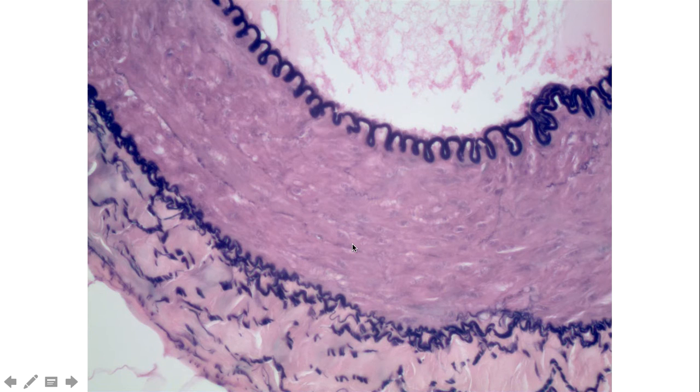And so if we take a closer look at the same slide, just at one particular area, we can now start to see that very thin pink cellular layer here. This is going to be that tunica interna, right? This is that simple squamous layer with a little bit of loose areolar to support it. And so it is not the purple line here. This purple line is that internal elastic lamina.